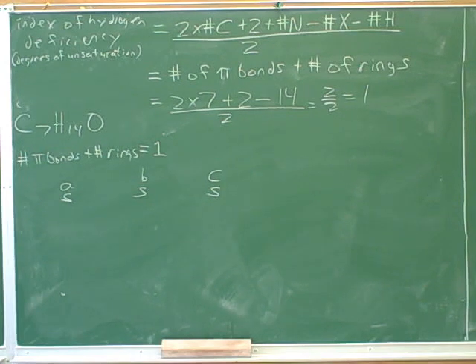I have a hard time determining the chemical shift just by knowing how to break up the area along the x-axis. I could take guesses, I guess. Which group is your group A? Point to group A. Now, this solid white line should represent the number 2, and this solid white line should represent the number 3. And notice that there's faint lines in between. How many faint lines are there between the solid lines? Oh, you can't see them? All right, that actually might be a difficulty for you on the test. You need to make a plan for that. Do you usually wear glasses?